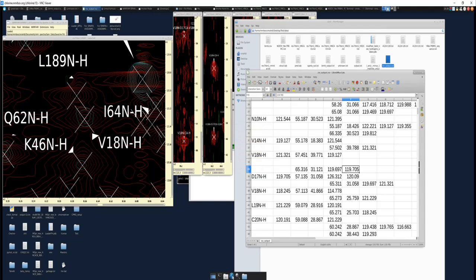So this, again, accelerates the process for assignment. This can immediately show you the anchor points. And this is a good peak to start with to try your assignments, since you have both I minus 1 and I plus 1 matches. So you not only have 2 amino acids, you have 4. And you can directly input those 4 into Sparta and should be able to just do your assignment right off the bat. So this again just helps accelerate the process.